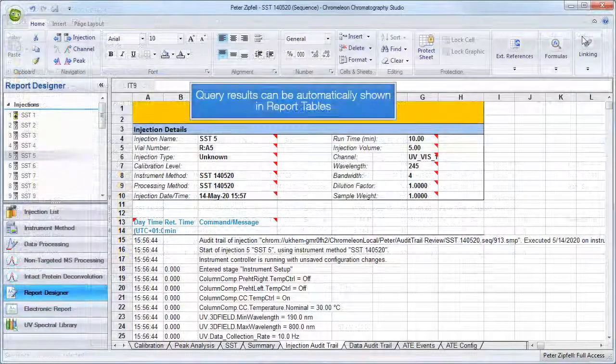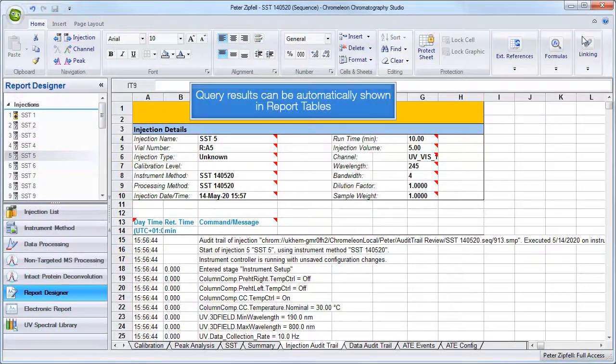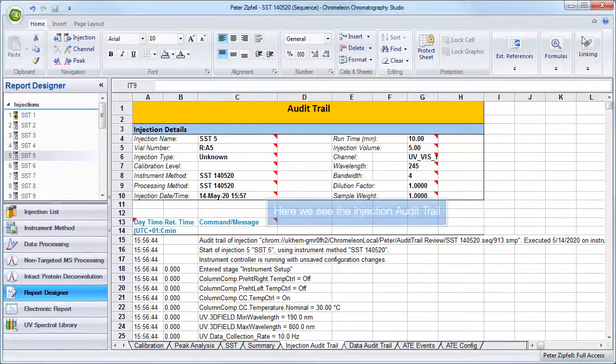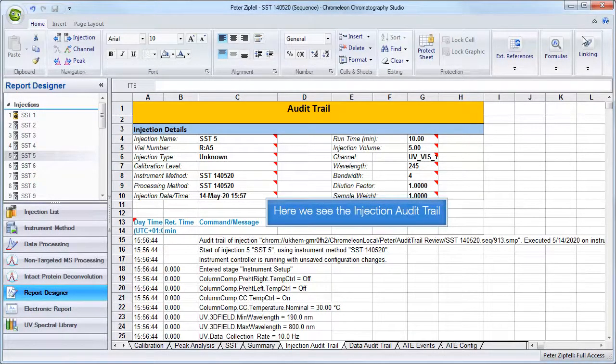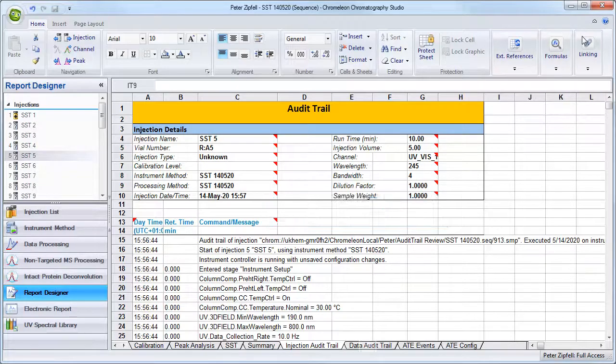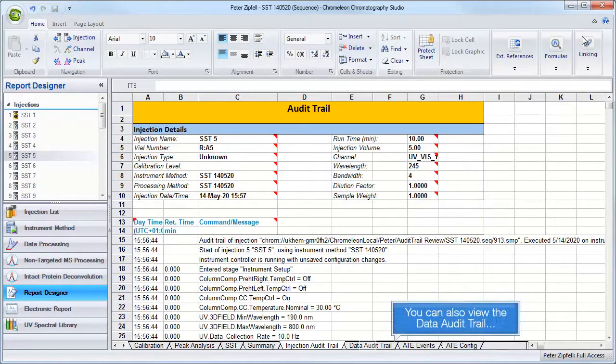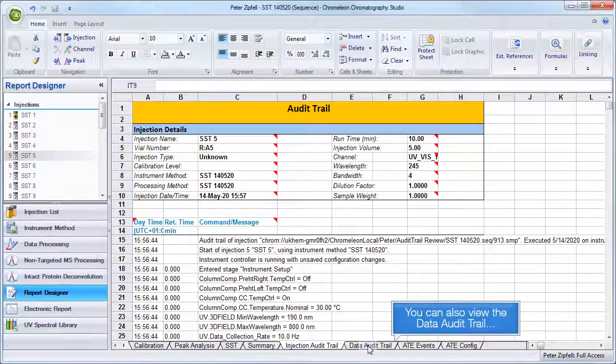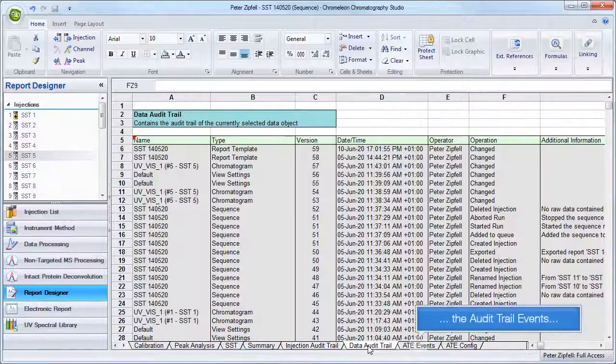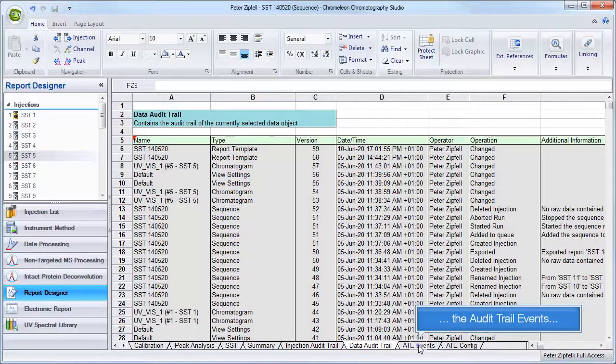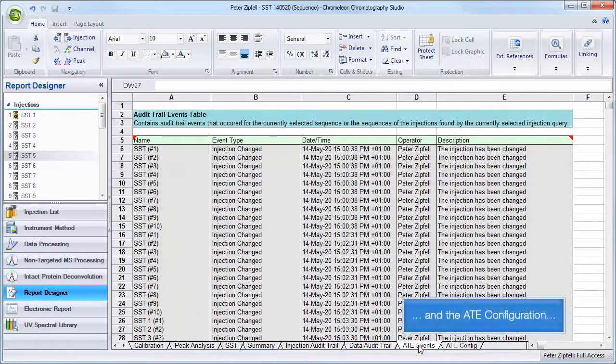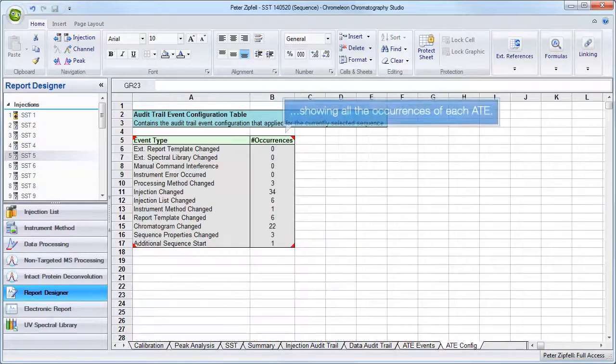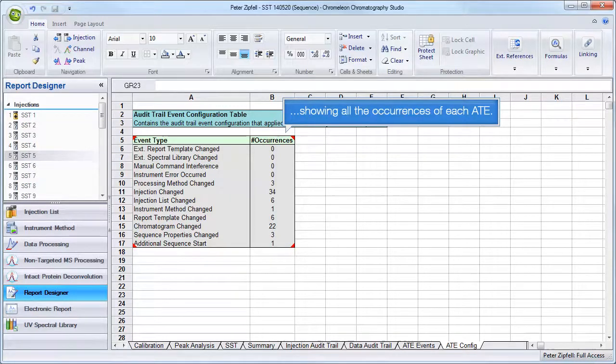Query results can be automatically shown in report tables. Here we see the injection audit trail. You can also view the data audit trail, the audit trail events, and the ATE configuration, showing all the occurrences of each ATE.